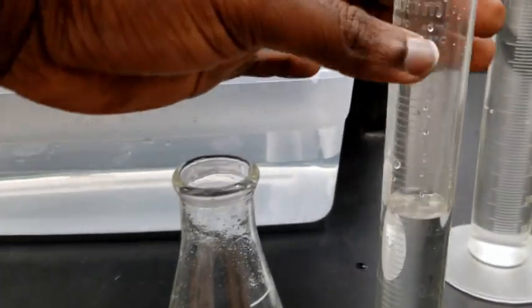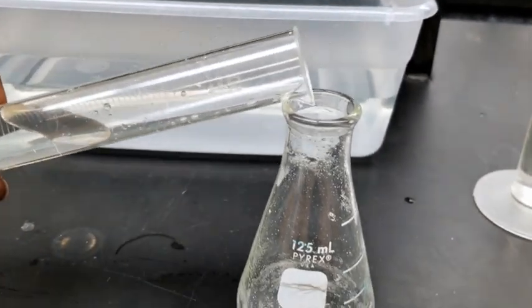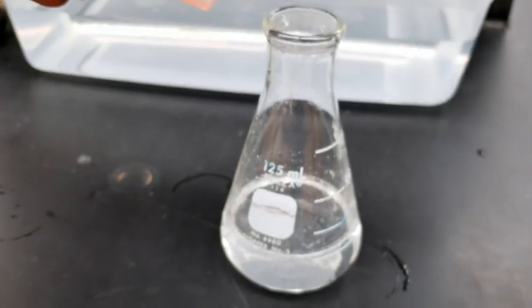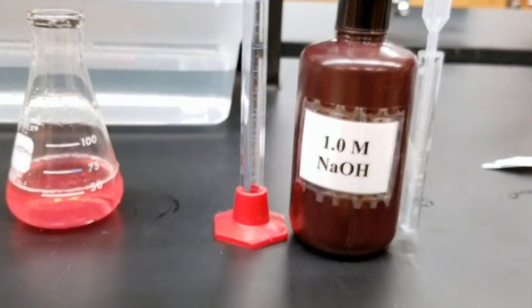Use another 50 milliliter graduated cylinder and add approximately 35 milliliters of distilled water to the mixture of your HCl and the tablet. Add approximately three to five drops of methyl orange indicator to your solution and swirl the solution gently.